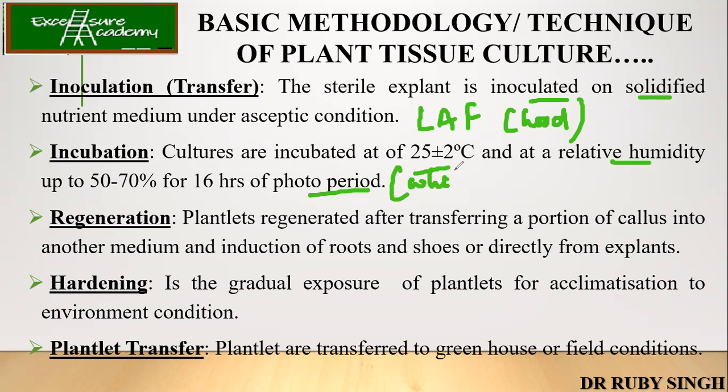They use white luminescent or white tube light. Now regeneration. Plantlets are regenerated after transferring a portion of the callus into another medium, with induction of roots and shoots. Sorry, it's not shoes, it's shoots, directly from the explants.